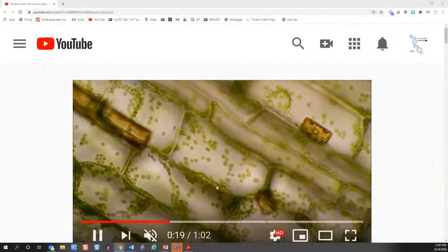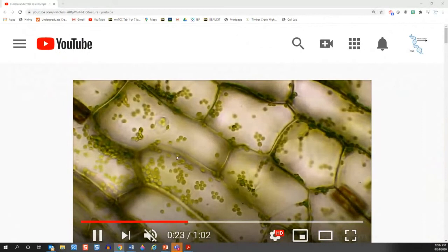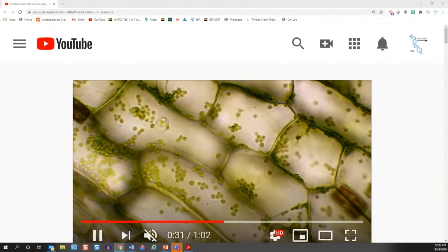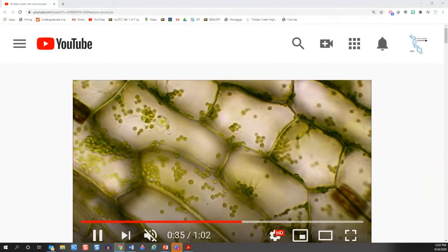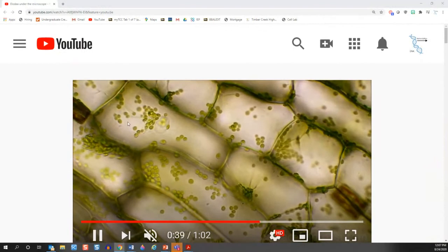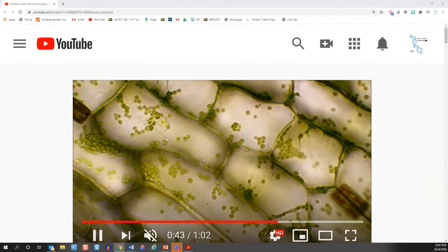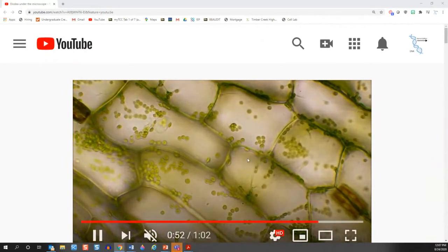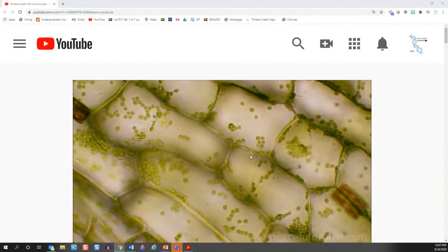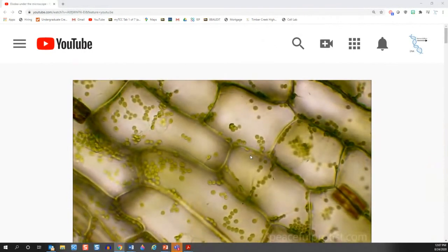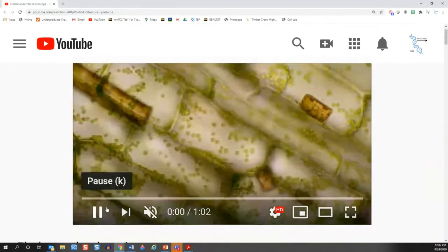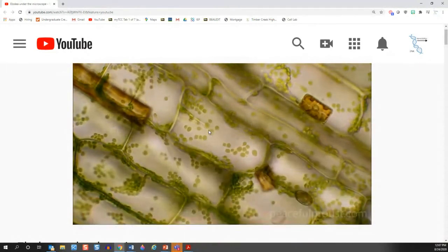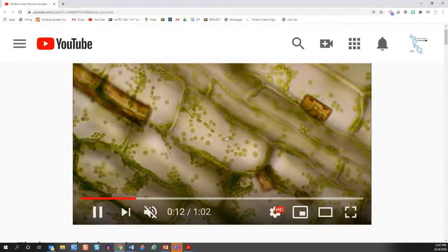So can you see here — this is the outline of the cell. That's my plasma membrane. Now this is a plant cell, so it has a cell wall around it too, which is why it looks so thick. This kind of white open space is my cytoplasm in this particular cell. Oh look, you can see the nucleus — everybody see that round structure right there? And then these little guys are the chloroplasts. There are lots and lots of chloroplasts in plant cells, which is what makes plants look so green. And inside these chloroplasts is where photosynthesis is happening.